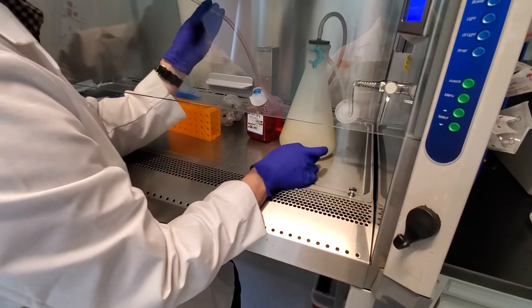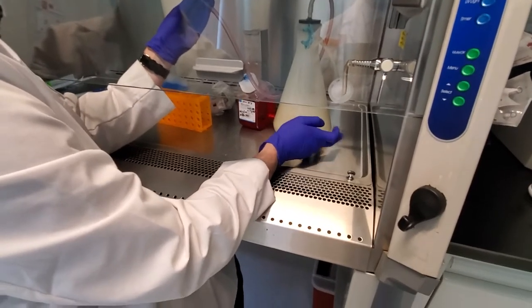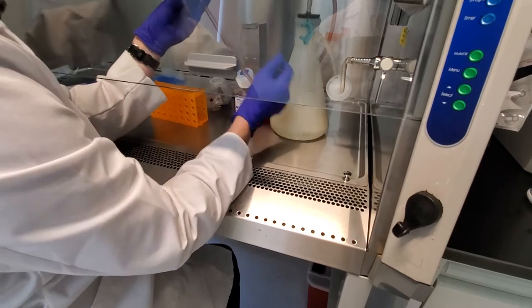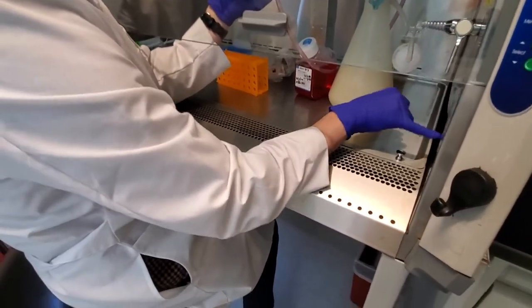Keep an eye on this. If the level gets up to the full line, this needs to be dumped and changed, because we start with bleach down here. It neutralizes everything in here, and we can just dump it down the sink and then add new, more bleach to the line before we put it back in. Keep the bleach underneath the sink.